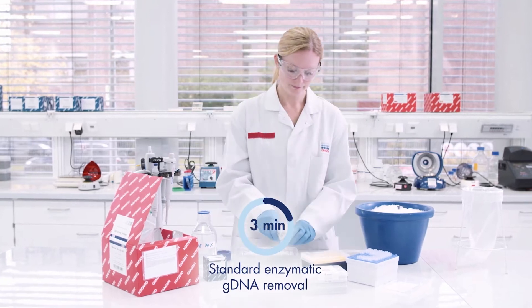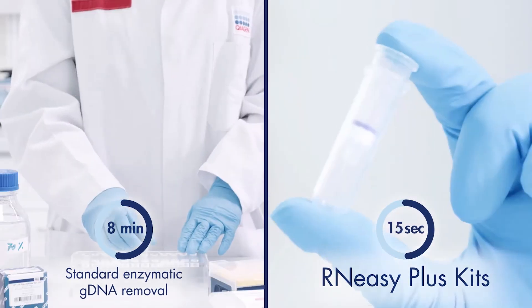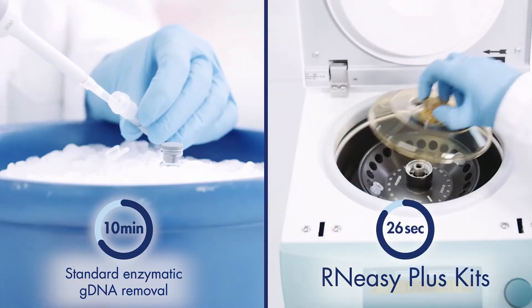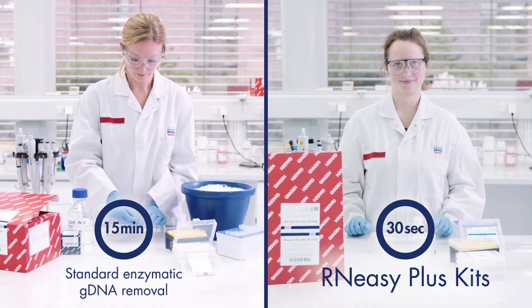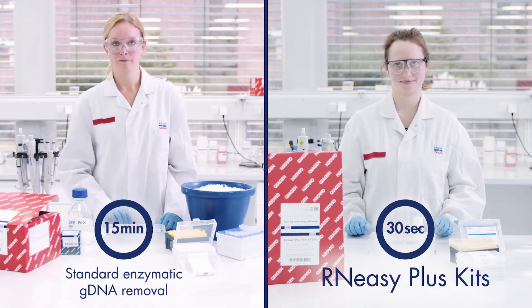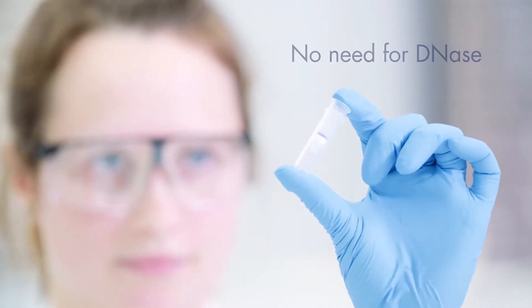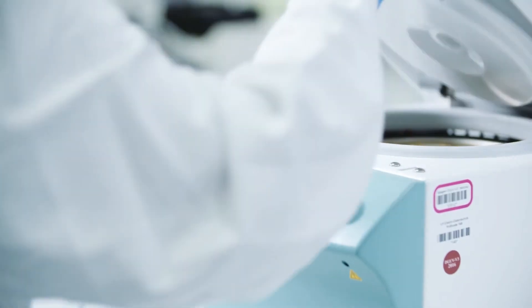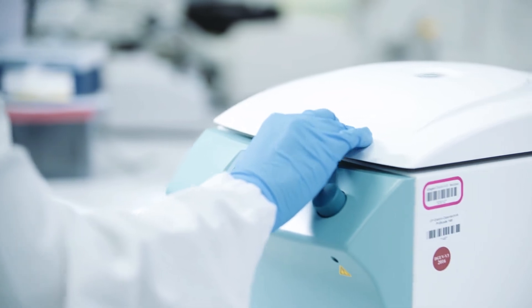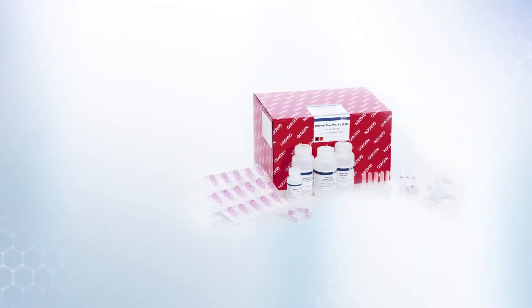Standard enzymatic GDNA removal takes at least 15 minutes. With RN-EZ Plus kits, the same result is achieved within 30 seconds. The unique GDNA eliminator columns remove GDNA more efficiently than DNases, resulting in fewer steps without compromising on RNA yield and quality. Instead of combining RN-EZ kits and DNases, you just need one RN-EZ Plus kit.